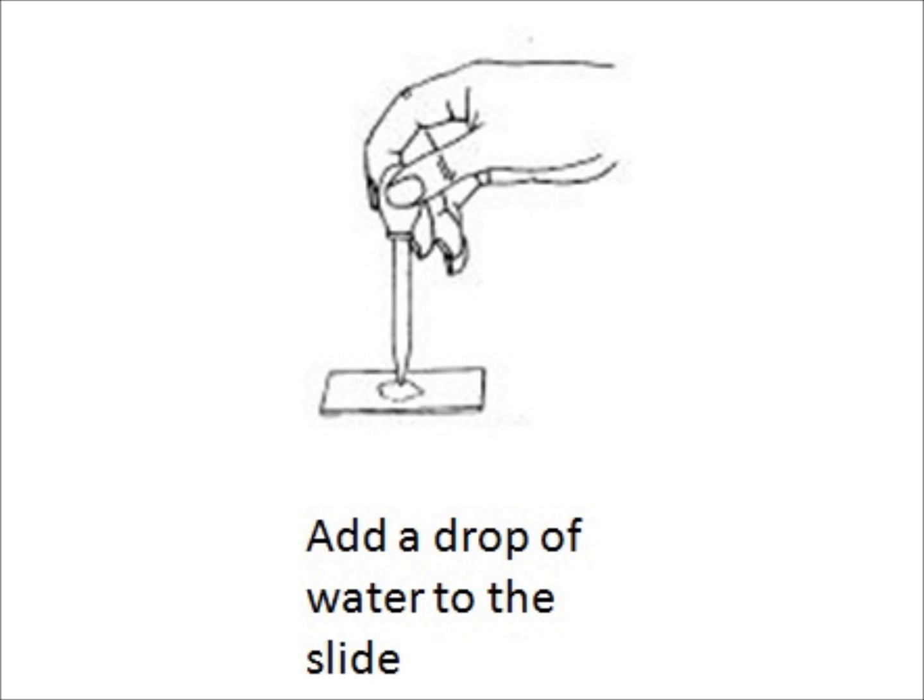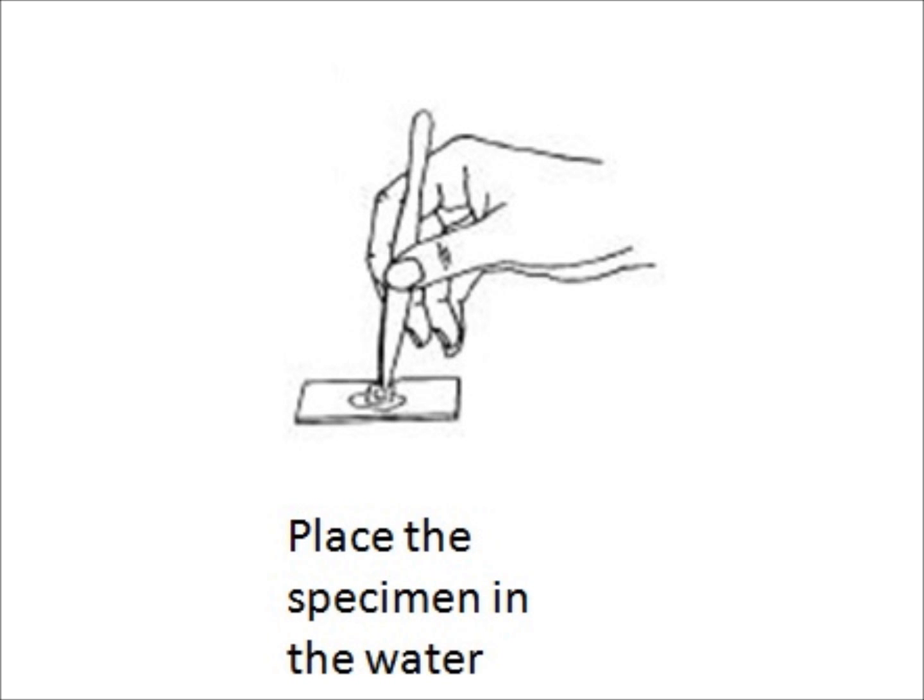In order to make a wet mount, you need to put a small drop of water onto the slide and then just place your specimen in the water. In the case of the rhizopus, it's worth probably just teasing the specimen apart a bit so that the spores are well separated.